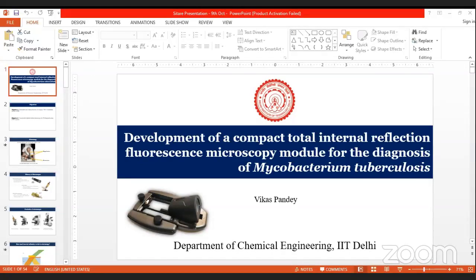Yes, sir. And there is a virus particle which is microns in size, and people generally say it is visible in a light bright field microscope, but we cannot exactly identify that virus in a light bright field microscope. Can it be possible to observe it using this setup, sir?